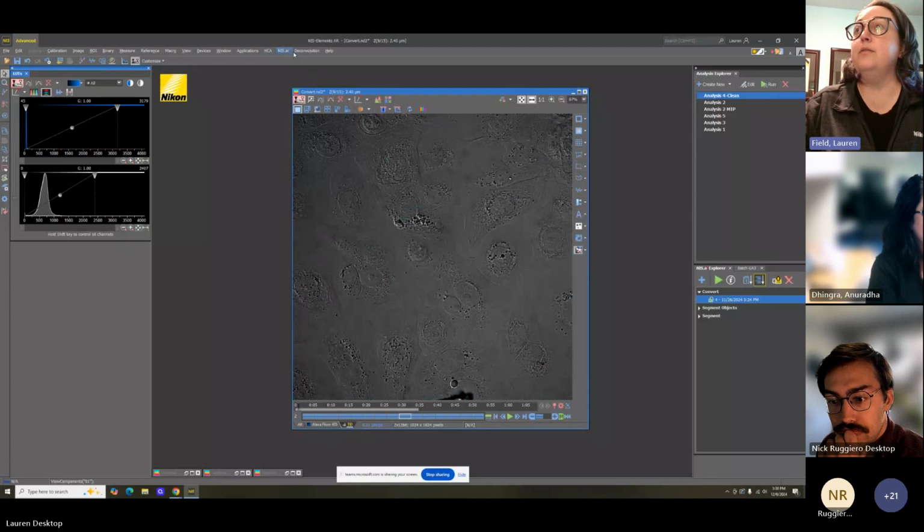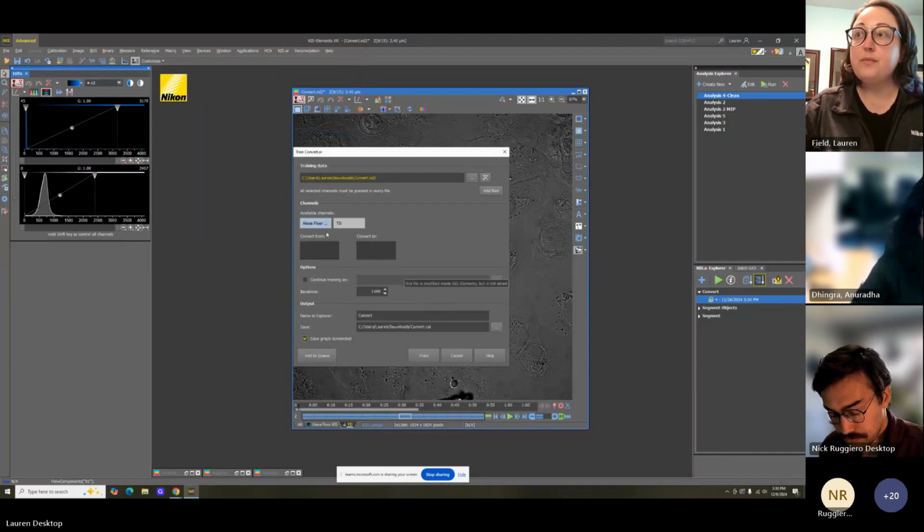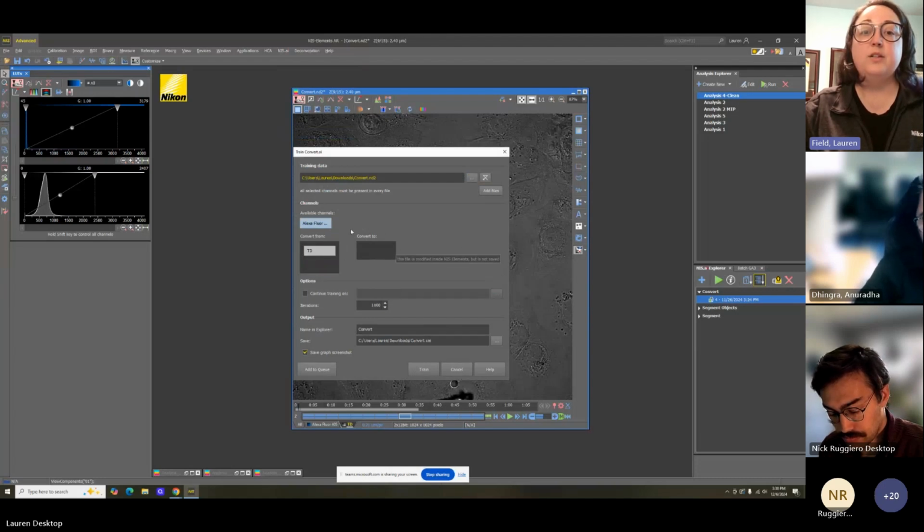We want to give our train convert this file. We're going to want to convert from the transmitted channel to produce an Alexa Fluor channel, the nuclei channel. This would be one where you would continue training, run it, and then hopefully produce a result.